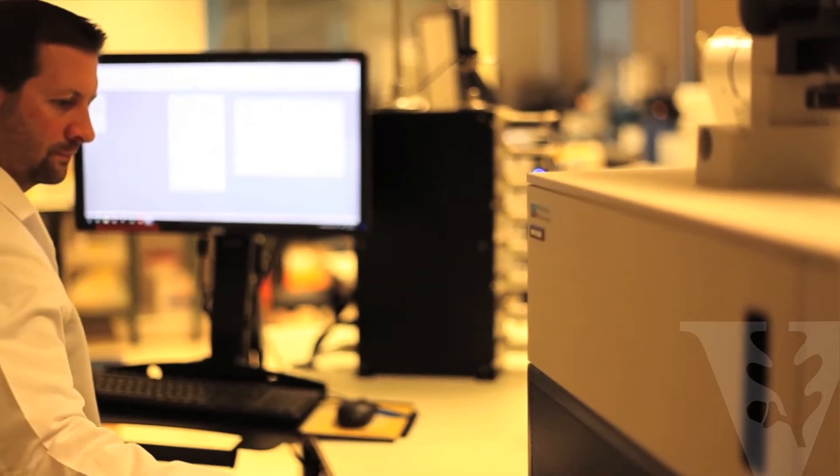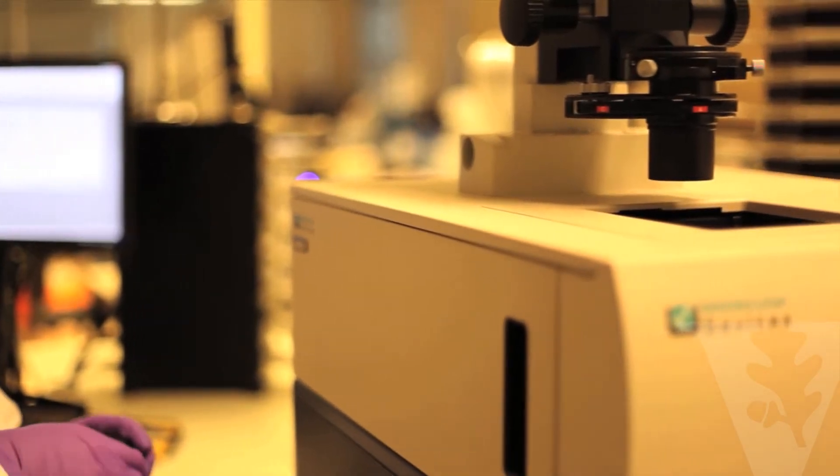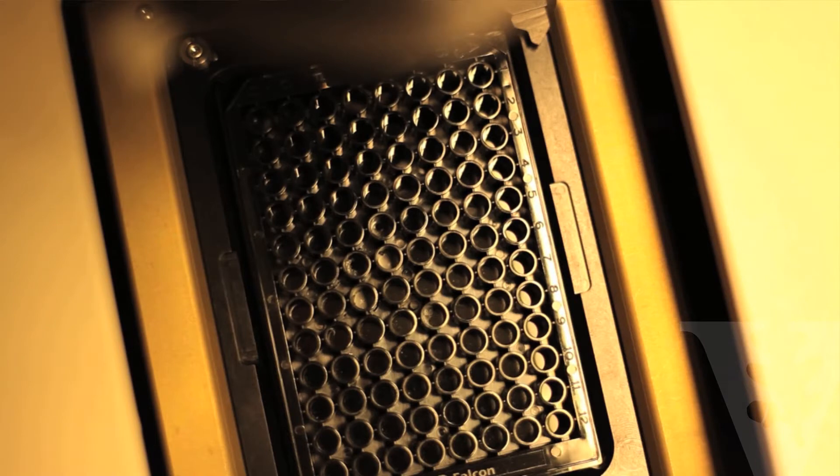Our knowledgeable and skilled scientific staff can assist with assay development, data generation for grant applications, and data analysis.